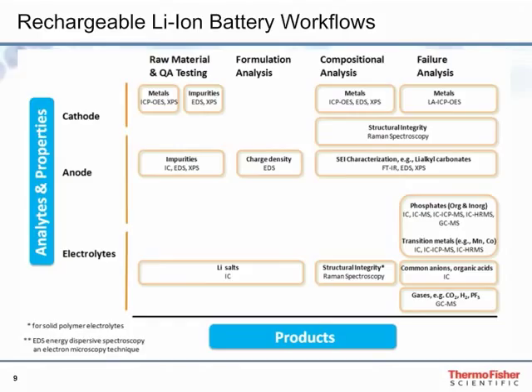As indicated here, there is no single analytical instrument that provides results for all of the components and processes relevant to lithium-ion battery operation. To investigate processes that will improve battery safety, lengthen the lifetime of the battery, and increase its power output, a variety of instruments and technologies will be needed to fully understand battery degradation processes and failure mechanisms for each battery component individually and how they interact together as a system.